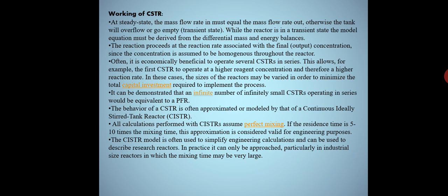Downstream processing it is the recovery process, मतलब यहाँ पर आपका जो प्रोडक्ट तैयार किया गया है उसे प्यूरिफाई किया जाता है, फिल्टर किया जाता है depending on the conditions which are required for that product. So yes, this is overall about the CSTR, the design and the working process of the CSTR.